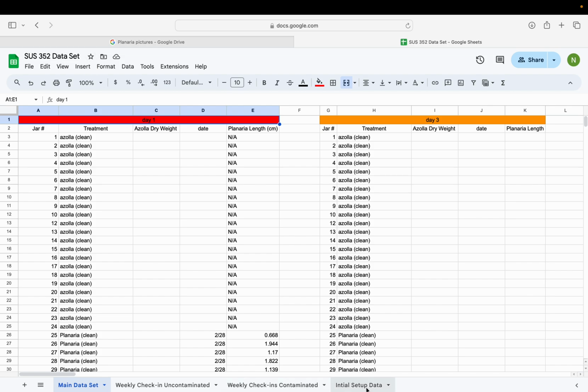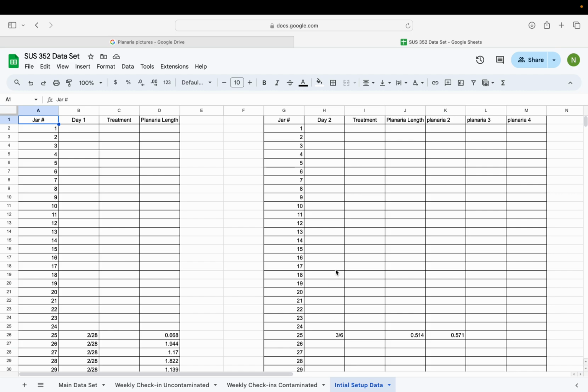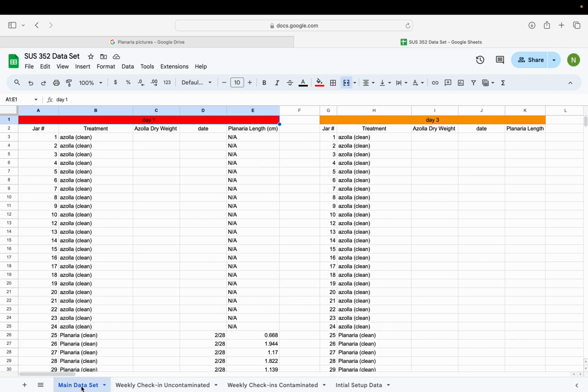And if you were wondering what I was doing earlier today in class, which was, I don't know, what's today's date, the 20th? Yeah, just ignore this. This is a complete mess. This is what we're gonna be more focused on here. This is what's fixed, and it's working right now.